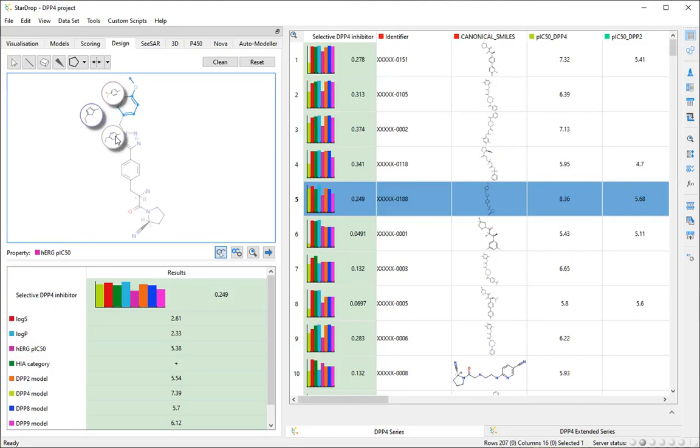If you point at a suggested substitution, you can interact with it in a similar manner to the ideas in the Inspyra panel, to dislike, ignore, or like a suggestion. You can select a suggested substitution by clicking on it. Click on a suggestion with a blue border that is predicted to decrease the hERG inhibition.